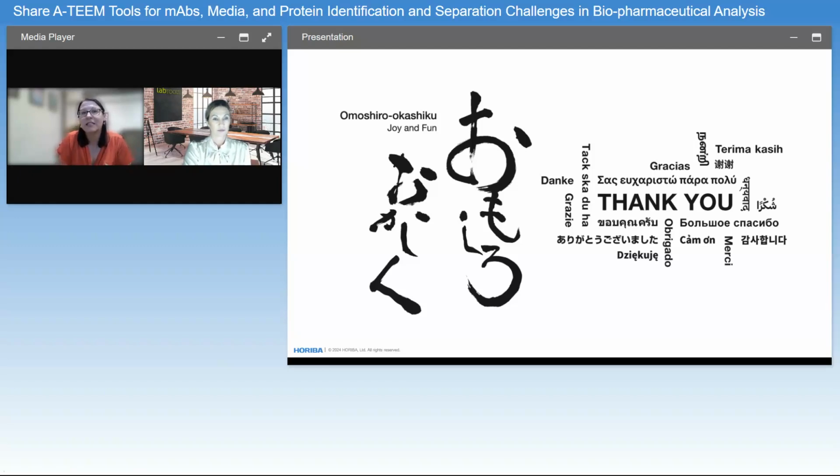So if you do have pure components, yes, I don't see why a library couldn't be used. And this is kind of part of the A-TEEM method development, right? If you have an A-TEEM method and you have pure components, this is the best way to build your calibration data set and multivariate analysis, and then to use your samples to try to validate that as well. So I guess the purpose of a library, you have to really understand the variation in your fluorescent materials and molecules to be able to build a library appropriately. But again, this is all part of A-TEEM method development that we're doing with every single one of the applications that I presented.